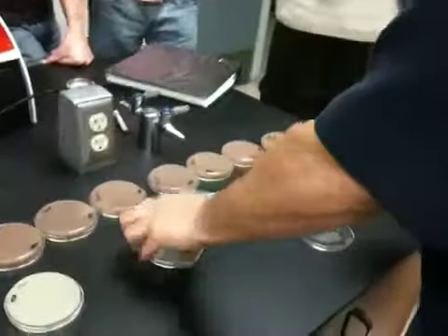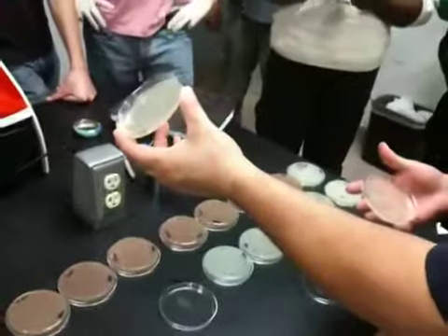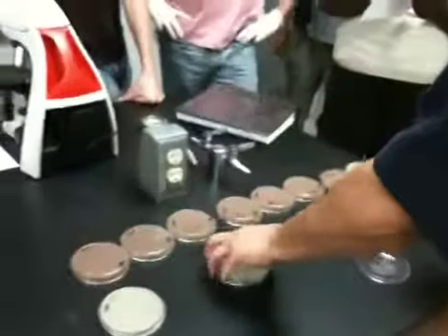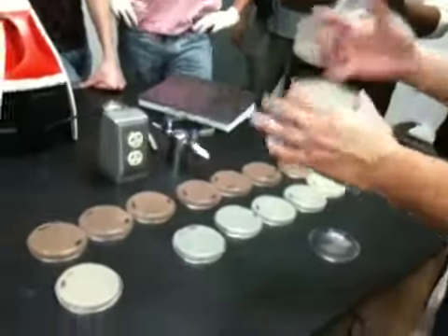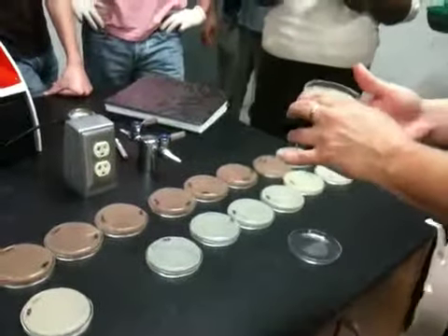You can see it on the 2 minute plate also, where it was protected only where there was protection by the shadows. We do have this other bug here that's in the middle of the plate just about. And so how do you think that grew? Or why did it grow?